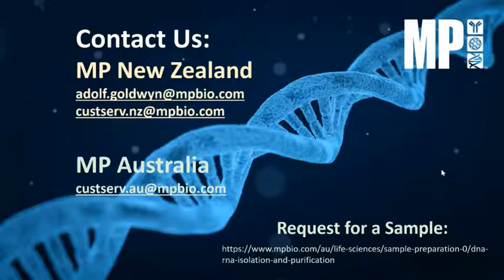Yeah, for diluted samples, the first thing that comes to mind is that you will have to centrifuge the sample at high speed so that you can remove as much supernatant as possible and process the solid precipitate. Processing the solid precipitate gives you a higher chance of achieving most of the DNA that is present, rather than processing the whole solution. Once you have these centrifuged solid particles, you can resuspend them in lysis buffer, transfer them into the lysing matrix again, and then proceed with the subsequent extraction steps.